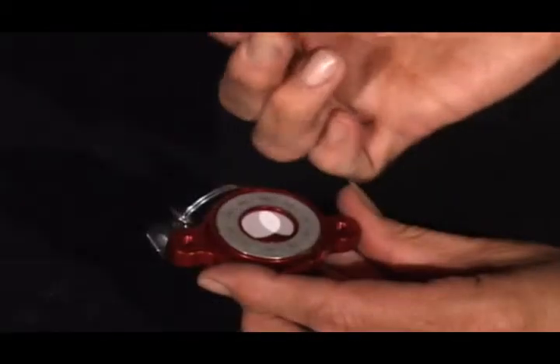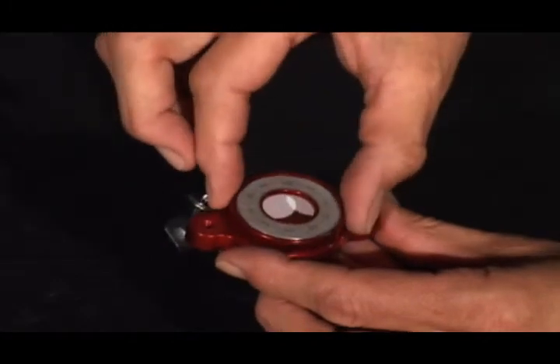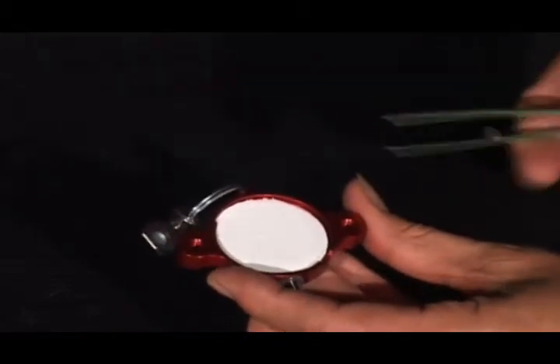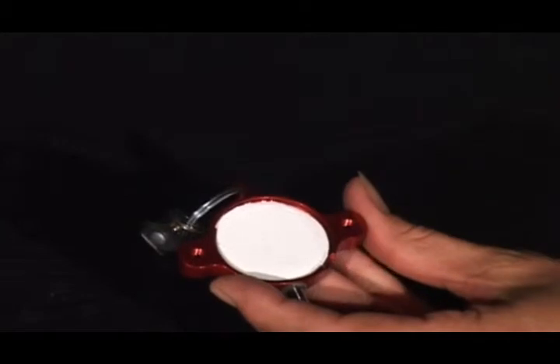Take the PEM out of the cooler and unscrew the pieces. Gently lift the impactor ring off of the filter surface. Clean your tweezers with alcohol and make sure your hands are washed. Notice that the bottom half of the PEM has a notch in one edge. This allows you to access the edge of the filter with your tweezers.